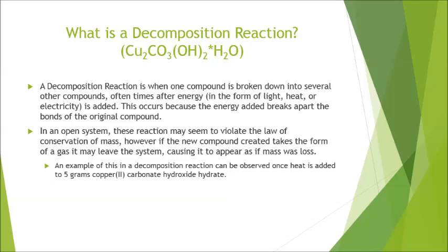In an open system like the one observed in late night labs, where the crucible wasn't sealed completely shut, which would be a closed system, the reaction may seem to violate the law of conservation of mass, which says matter cannot be created or destroyed. However, if the new compound created takes the form of a gas, it may leave the system, causing it to appear as if mass was lost.